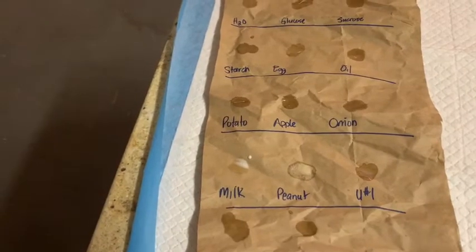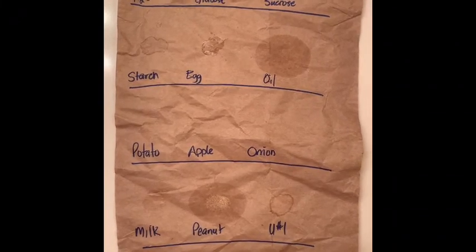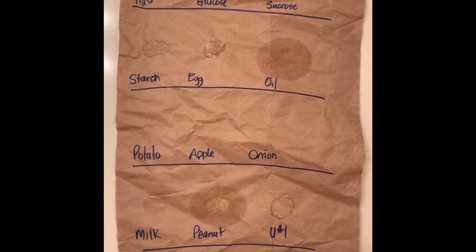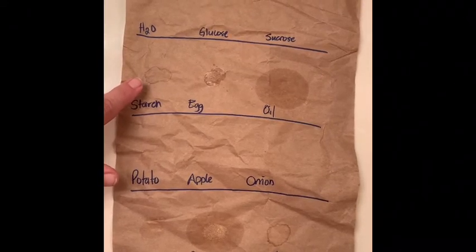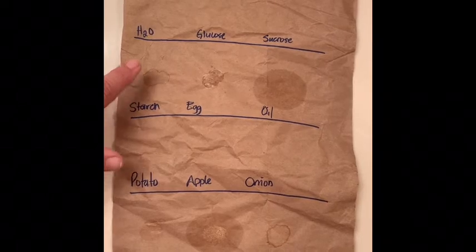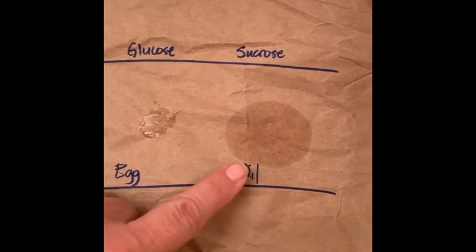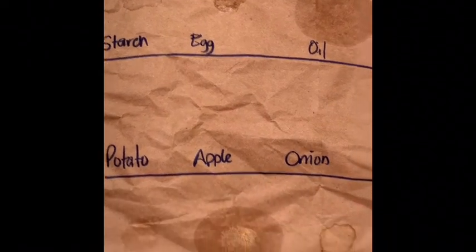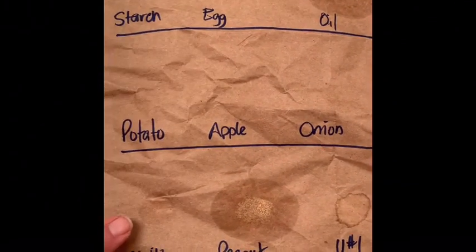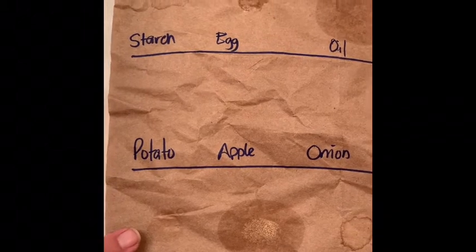Here are the results from the fat test after letting it dry for a few hours. There's some slight discoloration for the starch, which is a bit unusual and may actually be contamination. But you can clearly see a shiny spot for the egg, and a definite large shiny spot for oil - that's our positive control. Looking at potato, apple, and onion, we don't really see much in the way of fat. There's a little bit in milk, which isn't unusual because milk is a good source of certain fatty acids and lipids.